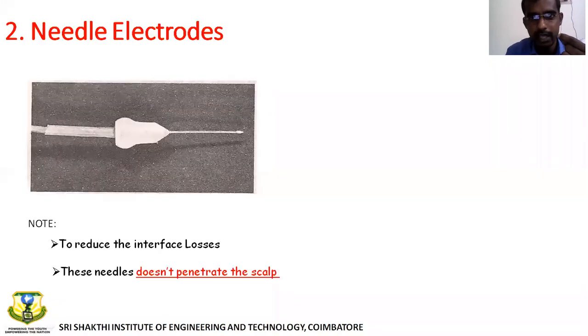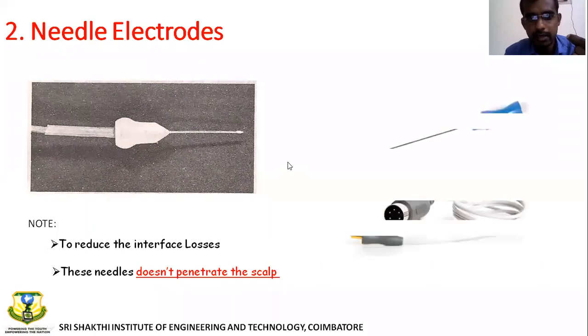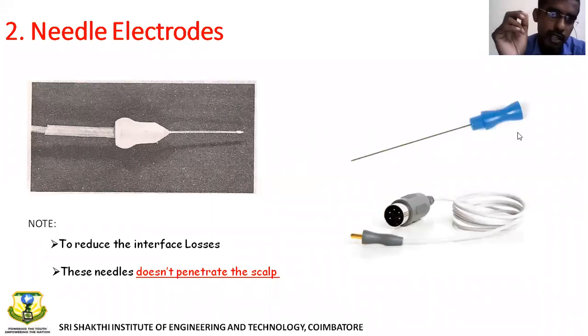It looks like an injection, right? This is a theoretical picture taken from the textbook, and the real one I've shown it here. It almost looks like this needle.